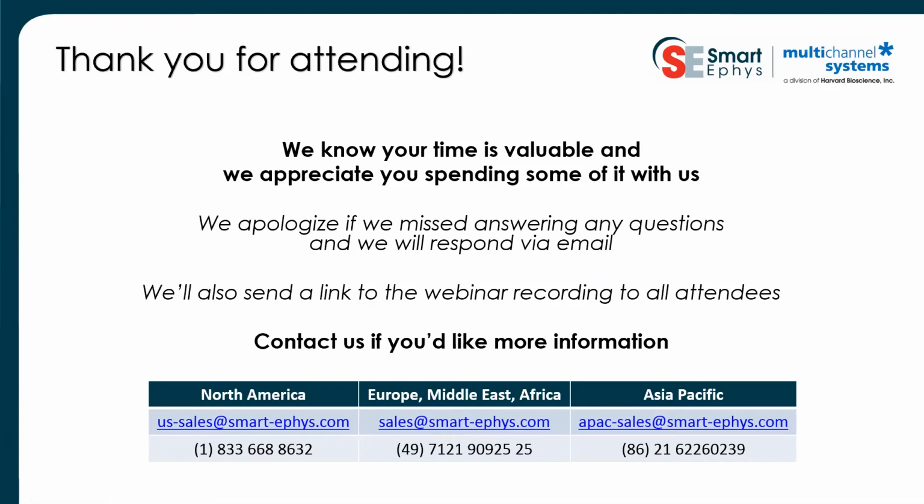I realized that after a certain period of time, it's difficult to say, but I would say after maybe 50 or 60 days, I could observe that the activity decreased. But we could see reproducible activity until day 34.